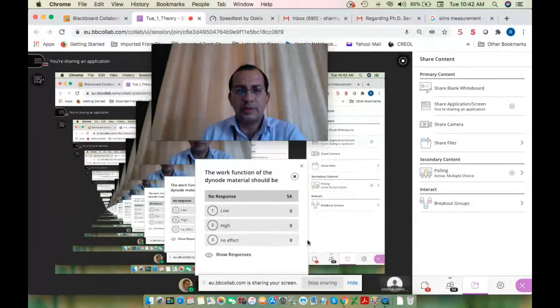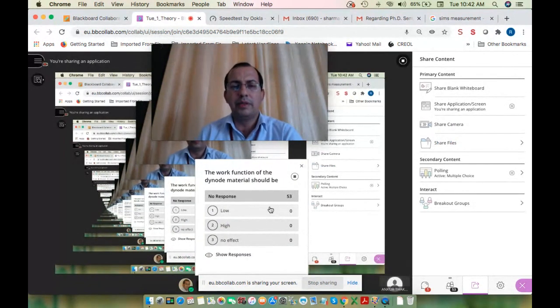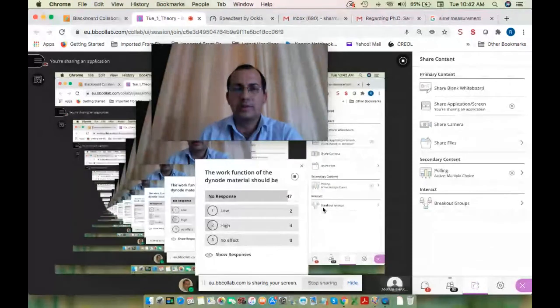Okay, so can you answer this query? The work function of dynode material should be low, high, no effect. Please answer this query.